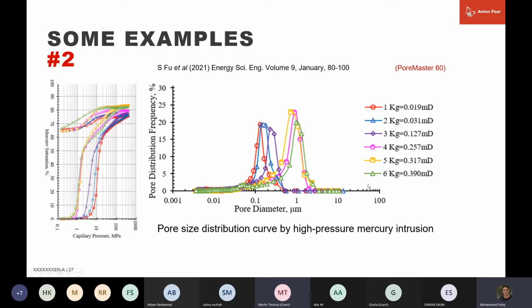Okay, and from these intrusion curves, the pore size distributions have been calculated. And they've got some other Klinkenberg numbers there, but obviously, one family, another family. Don't forget, these are normalized, so they will all look pretty similar in total volume and so on, percentage wise. So you can compare and contrast samples like this quite easily.